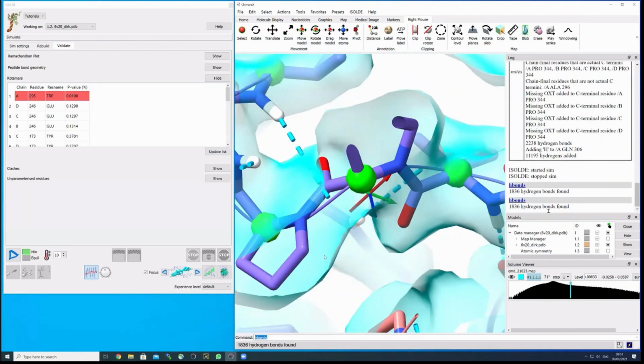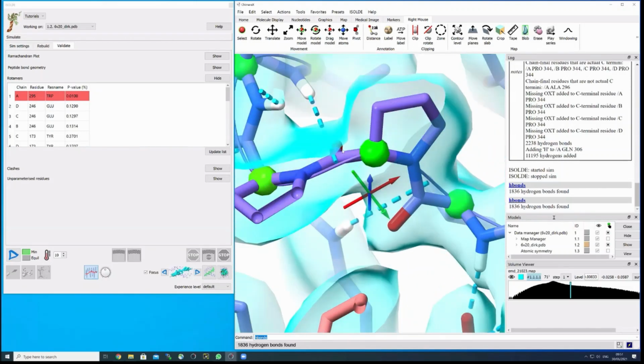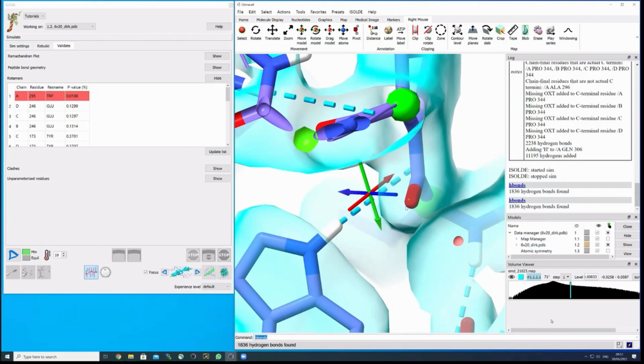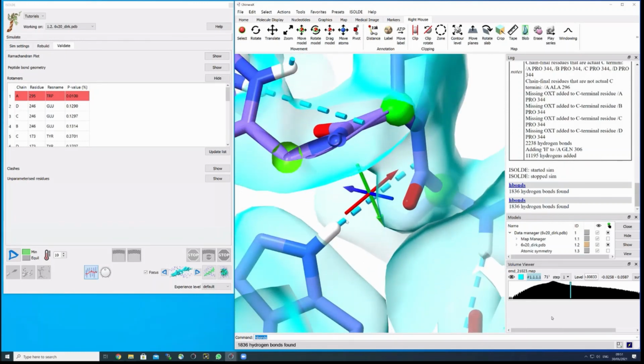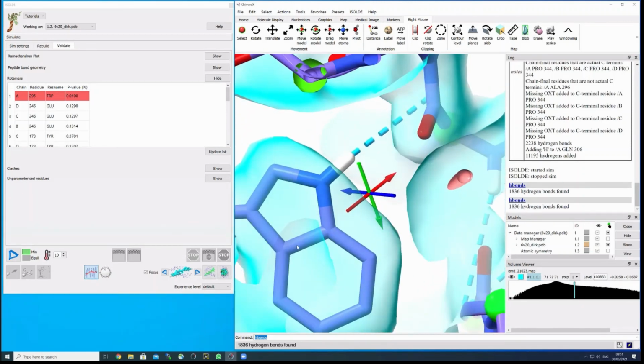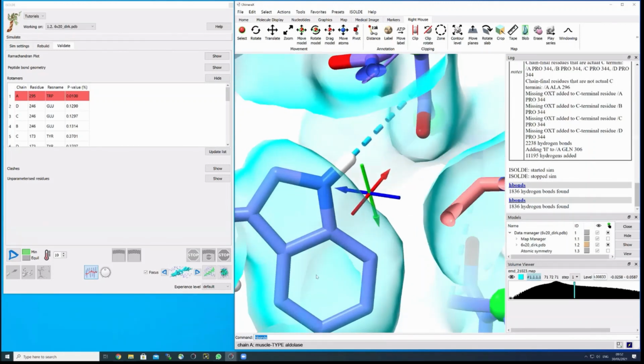Seems to be a bug. It's not going to the oxygen here, which it should. So the hydrogen bond is formed between those two. That also would support placing it as an outlier, even if the map quality wouldn't be as good.